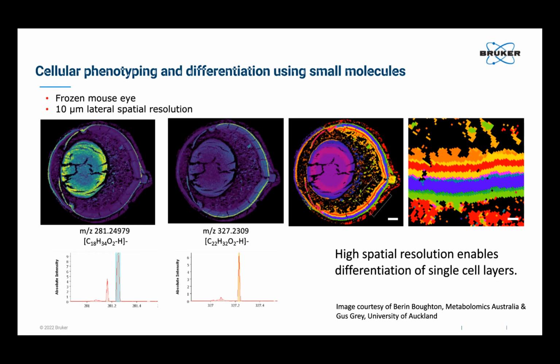and you can see the resulting images here and how they're in different locations overall within that eye. Then we can do a biologically a priori calculation. So no biological information goes into this, simply an algorithmic way of clustering together the pixels based on the spectra that are generated. So this is what we call a hierarchical clustering technique, in case you are familiar with computer science terms and how that would be done.